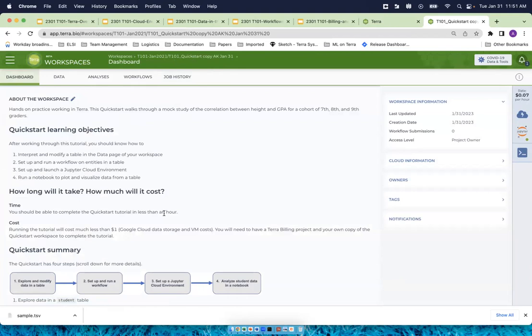No. Rather, I think it showed me... I think whether it's the cookie setting or something like that, it was not giving me access to this environment. I'm not exactly sure why that would be.